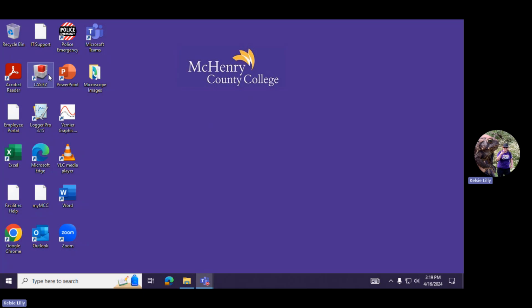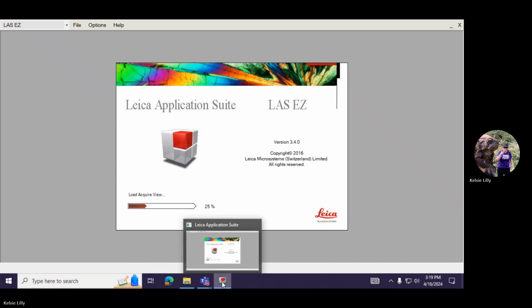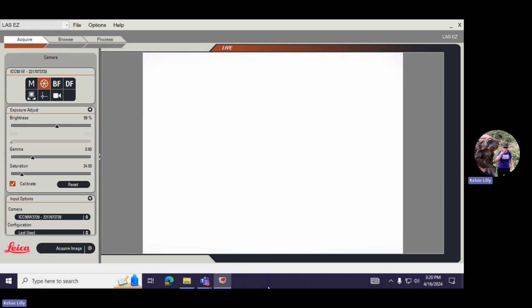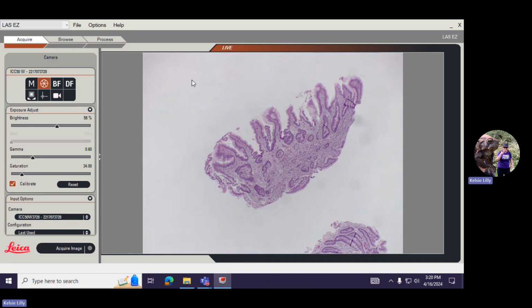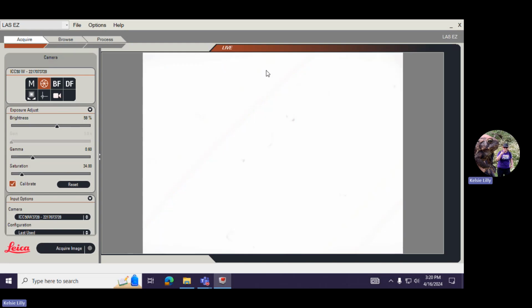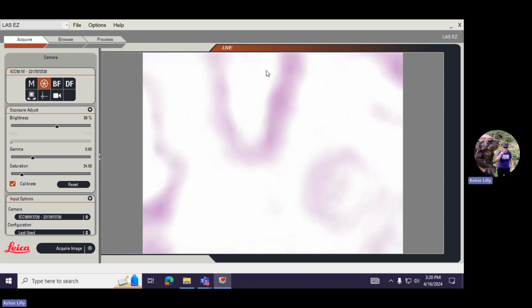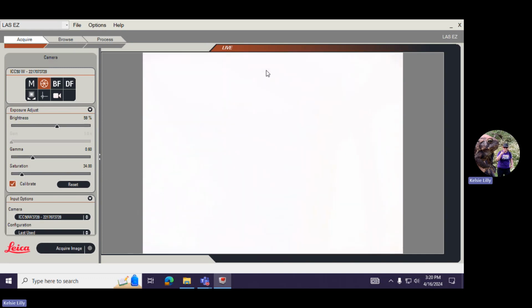So once you have your camera hardware turned on, we're going to double click here and our software is going to load up. Cool. There boots our software. We have our live image and there's our auto exposure coming into play. Right now I have the 4x objective being used. I can switch it to 10 and focus on the microscope, focus to go up to 40, focus on the microscope sample. So we notice that the light is adjusting automatically.